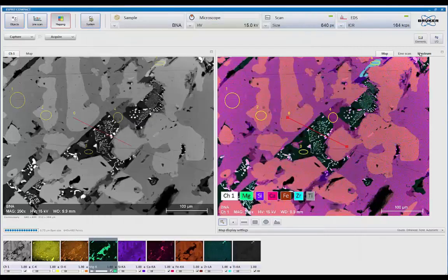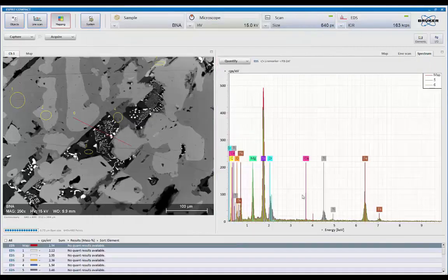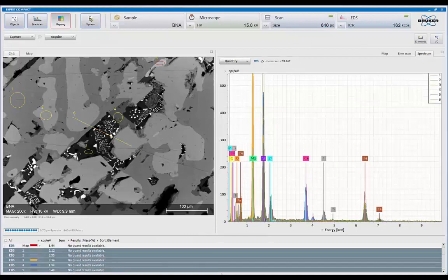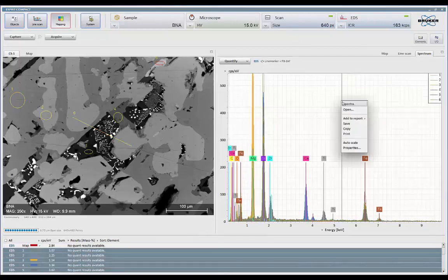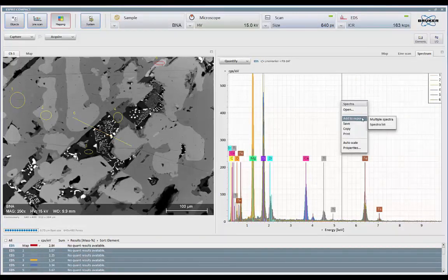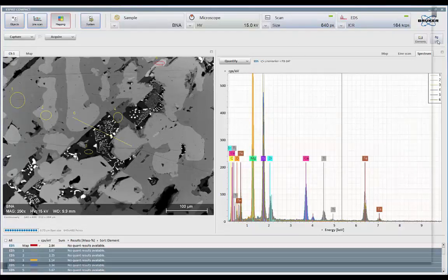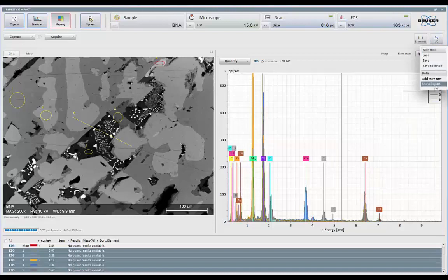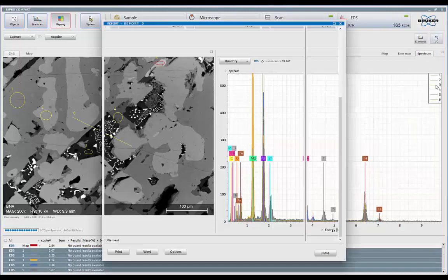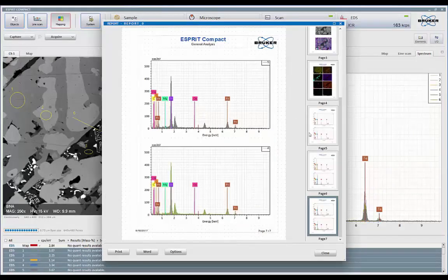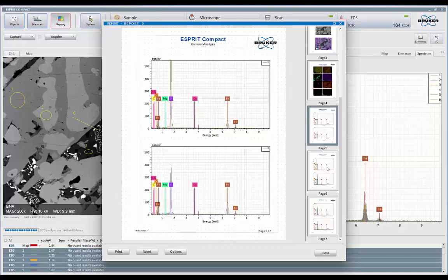Any spectrum I have in here, I can simply bring up onto the display. So I can come in here and say, let's add those to the report, multiple spectrum. And now I can say, show report. And there, each of the spectrum separately.